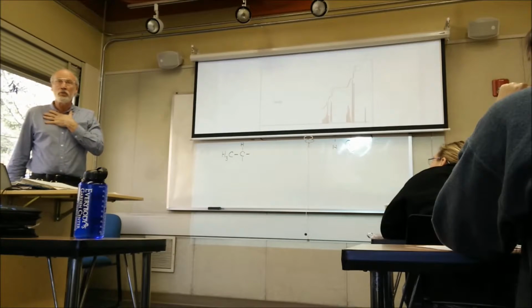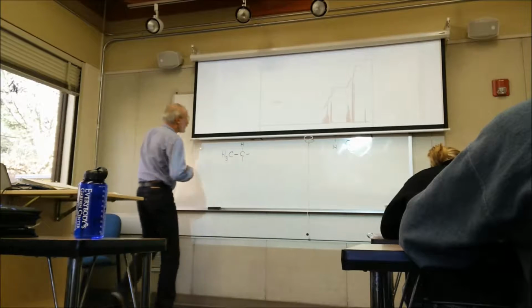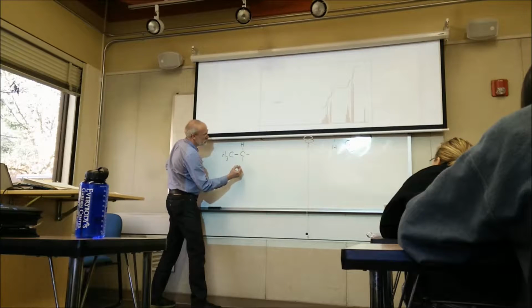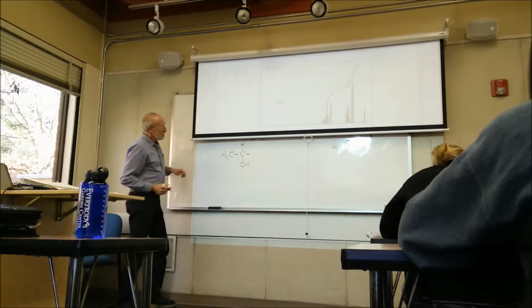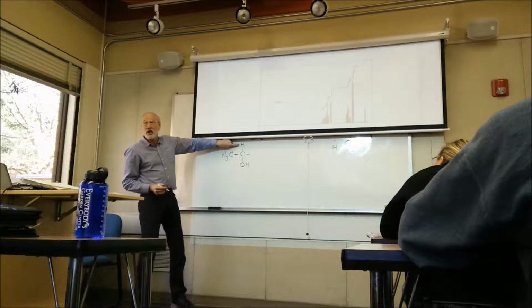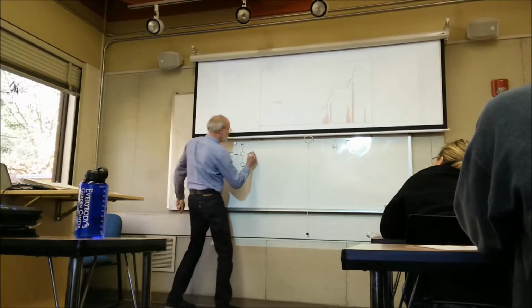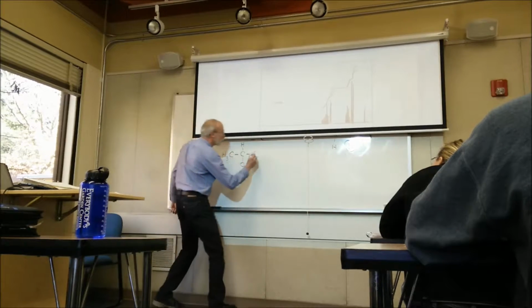So if we got an alcohol, what does that mean? With 2 oxygens and we have an alcohol, you got 2 OH groups. Okay. So if I put a carbon here, and I put OH there, okay, that would explain, let's see, that would be this peak. This one is not split by that. And this is not split by that. So we've got to have a carbon here, and there's only one other place to put a carbon. So we've got a 4-carbon chain.